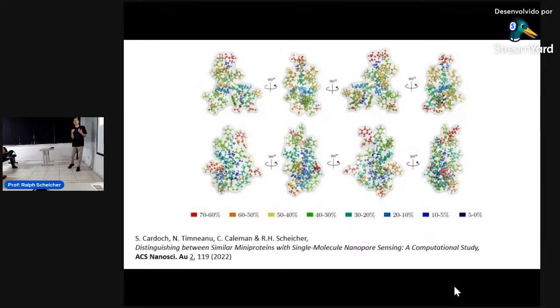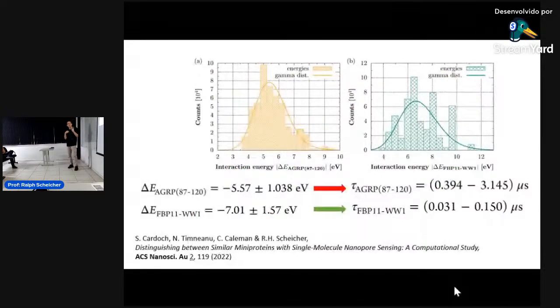The binding energy alone is, however, not enough, so we also need to know what amino acids are at the surface. We can quantify the exposure of the amino acids to the outside, and how likely they would interact with the nanopore wall. So without going into all the details, we can combine the exposure to the outside of the protein together with the interaction energy and predict some range of interaction energy. You see we have some large uncertainties here, which can then be translated into a translocation time. So how much time would it take for this folded mini protein to translocate through the nanopore?